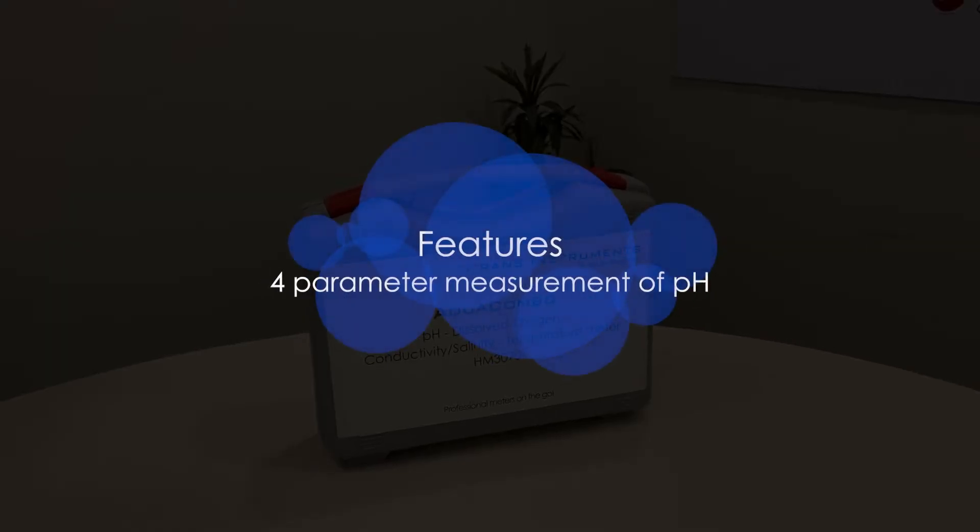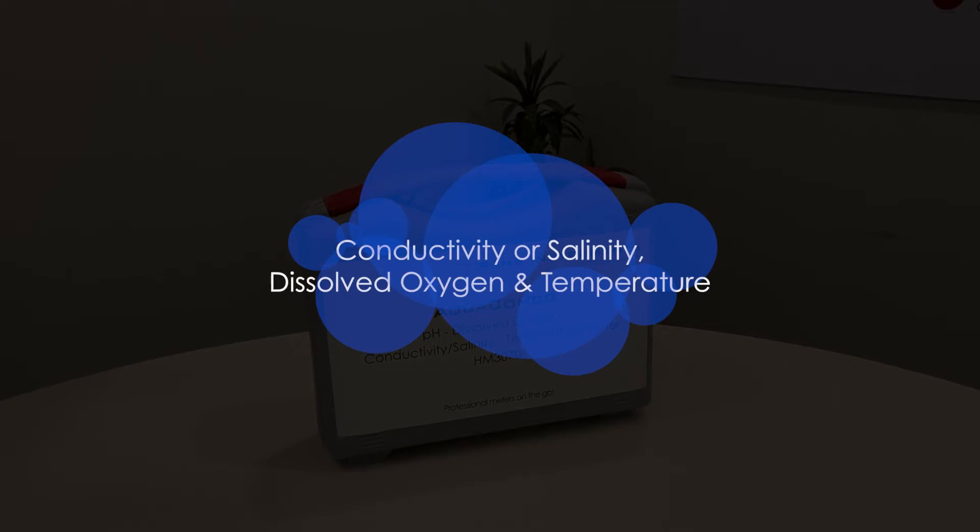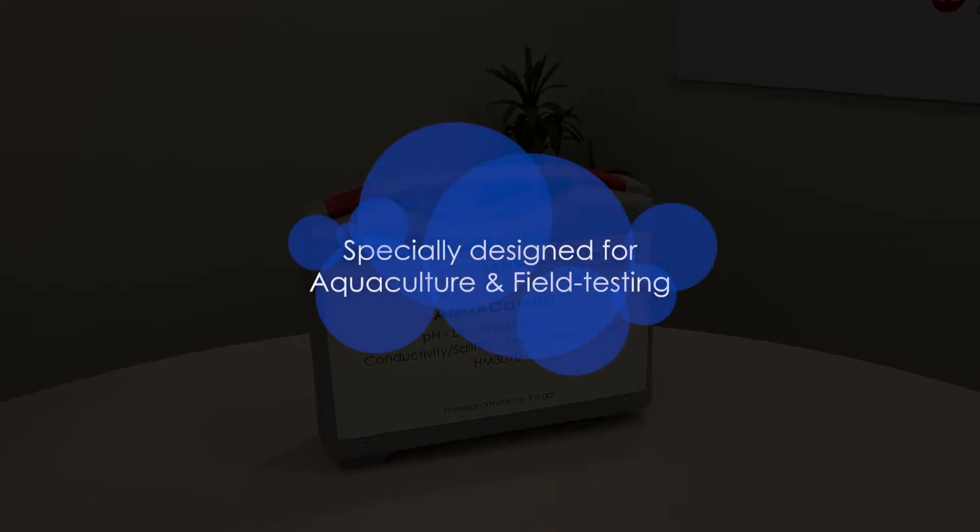The new meter features four-parameter measurement of pH, conductivity or salinity, dissolved oxygen, and temperature all at once. This meter is specially designed for aquaculture and field testing.